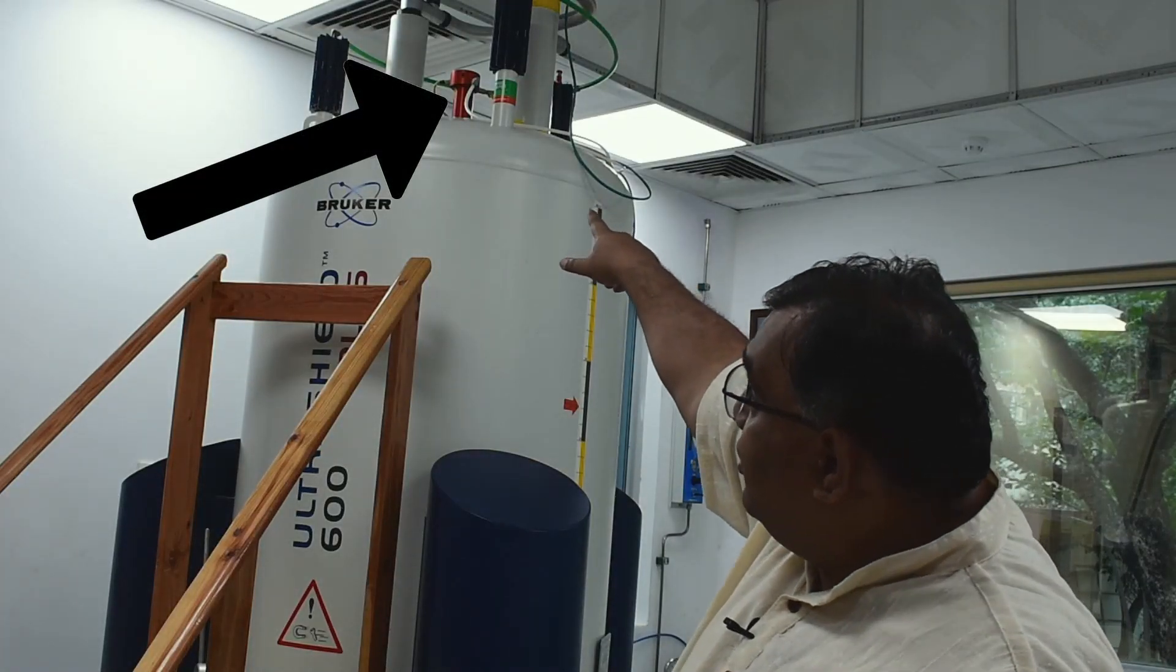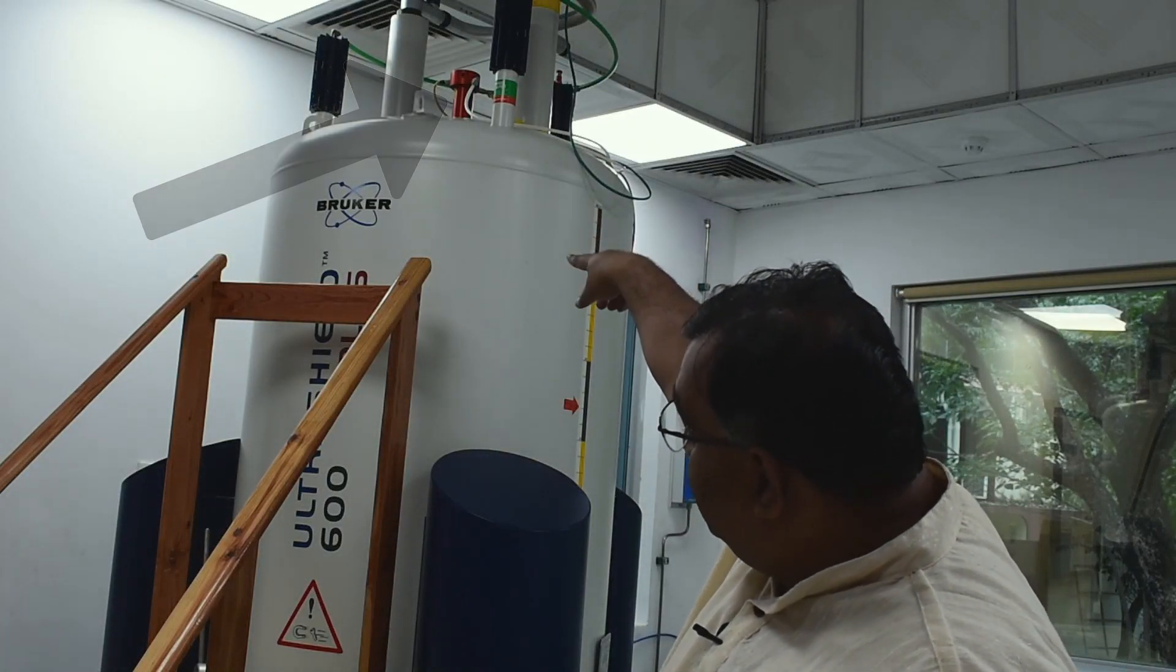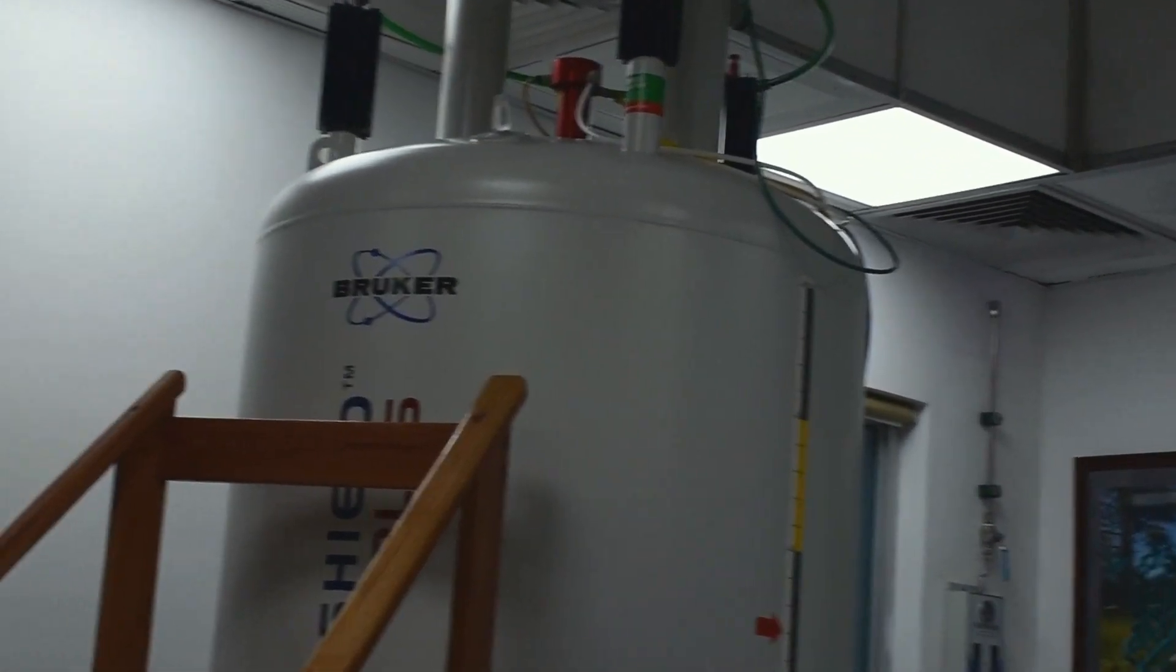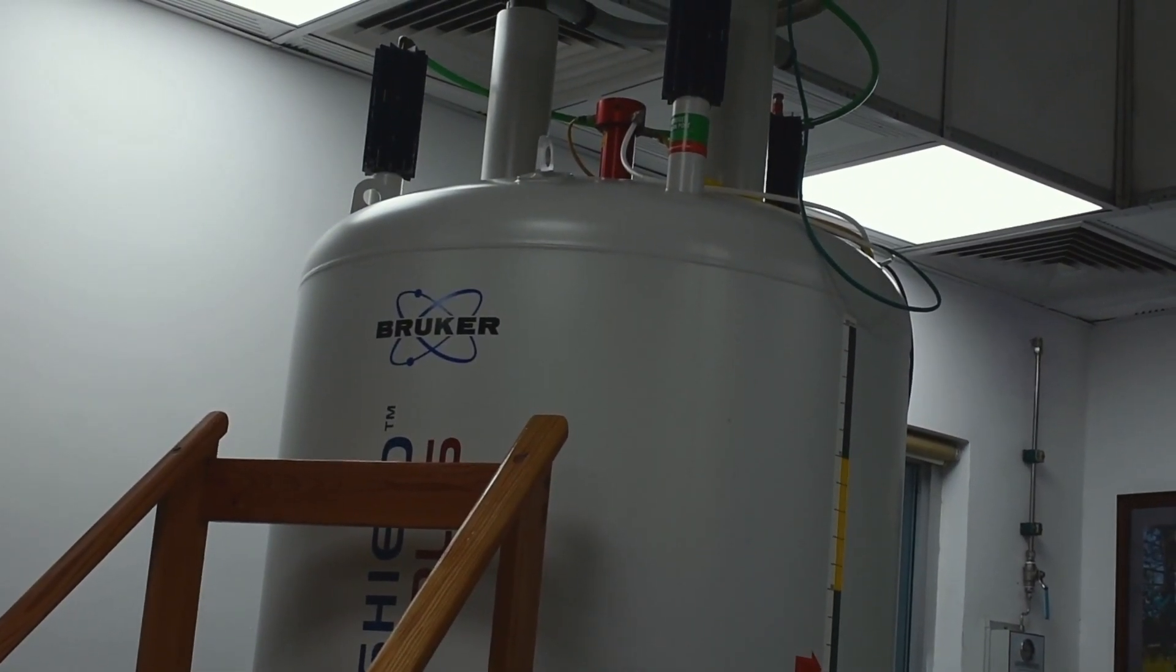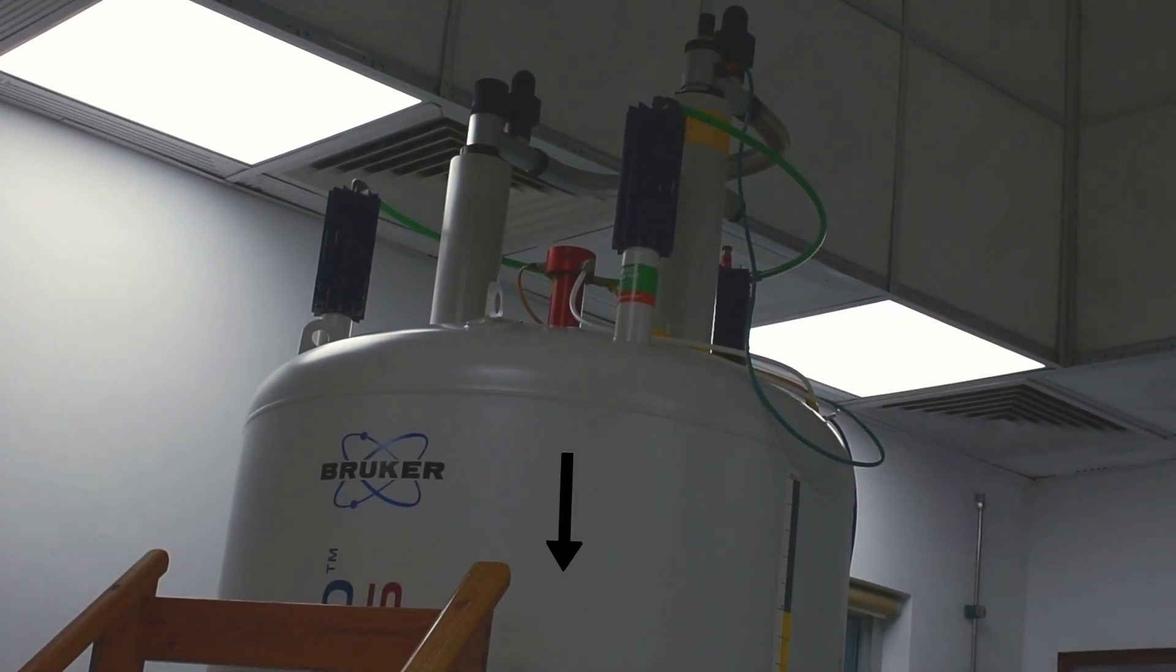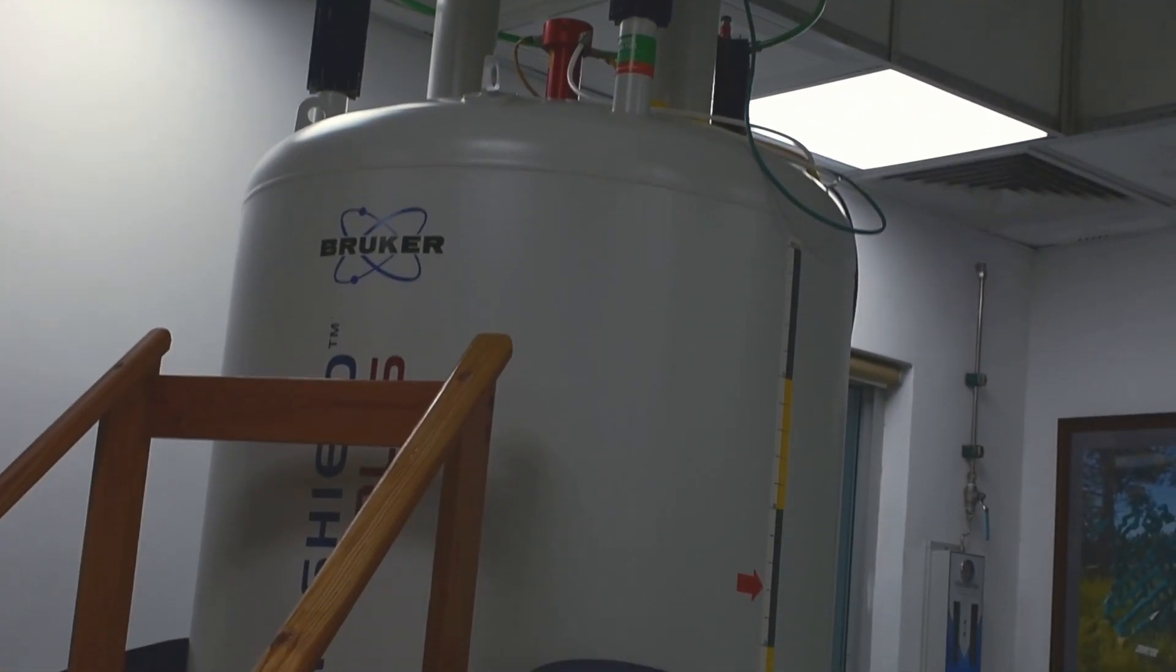Inside you see there is a copper color barrel and that's a copper color barrel that goes to the center. So the magnetic field is strongest in the center here. And that barrel shuttles your sample to the center of the magnet.